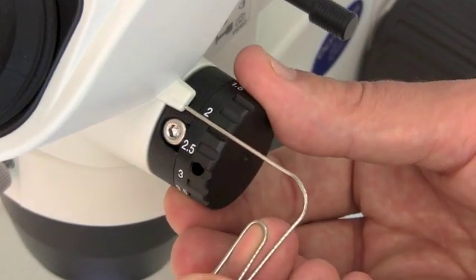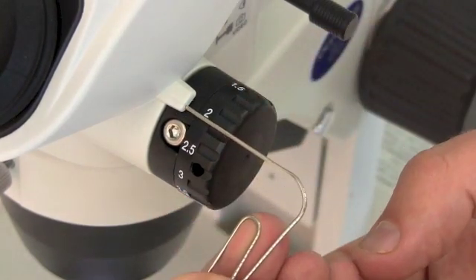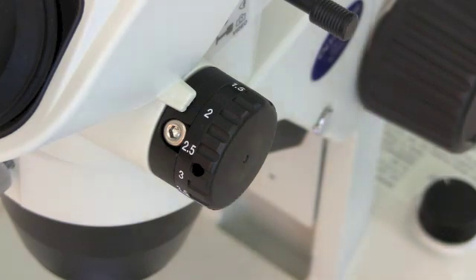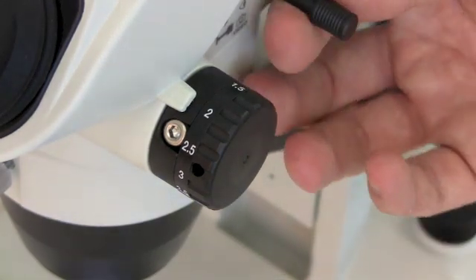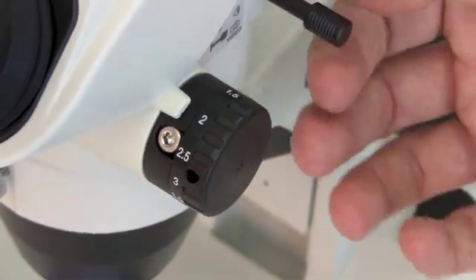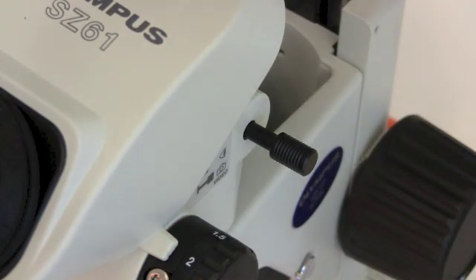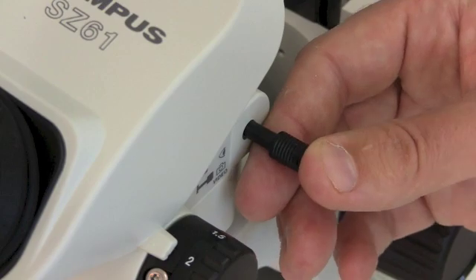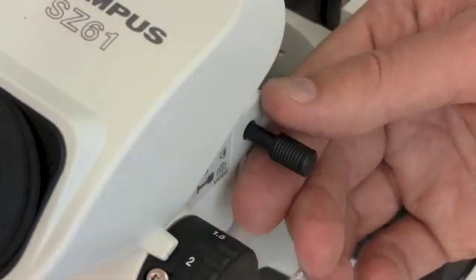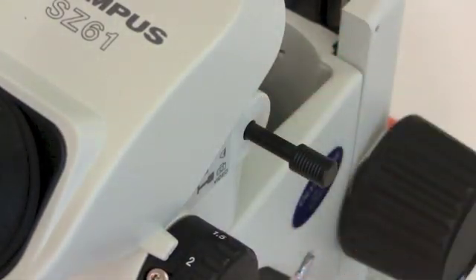The other important feature of the scope that you'll see here is this little do-daddy. It flicks between binocular vision and allowing the camera to see through one of the eyepieces. All the way in, you'll be able to see through both ocular lenses. And all the way out allows the video camera to record and you'll get images on the computer.